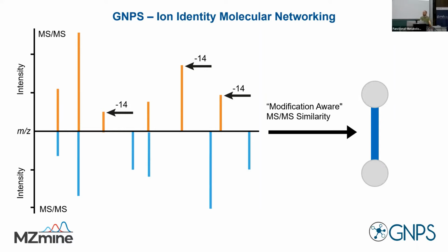Oh, it's the same neutral loss. We cut off the same branch of the molecule. That's why we keep the modification in the ion, and the other way around, we cut off the modification. So of course the parameters are the same, right? So there are still ways we learn to maybe also explain it.